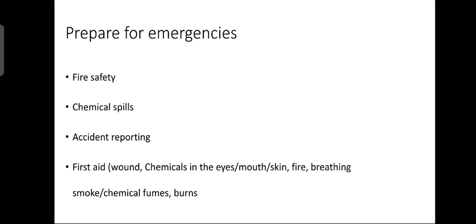Okay. Next is fire. A person whose clothing or hair catches on fire will often run around hysterically in an unsuccessful effort to get away from the fire. This only provides the fire with more oxygen and makes it burn faster. It is the responsibility of the teacher or the closest person to bring the fire blanket to the victim as quickly as possible.